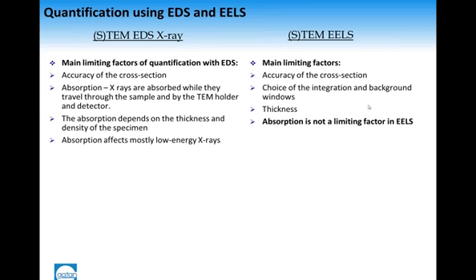So this actually is something very important to take into account. So we can get quantification very accurately from heterogeneous material. It's something that is actually affecting EDS in the case of heterogeneous material where we have light and heavy elements. It's the case of the sample device with the tungsten plugs.